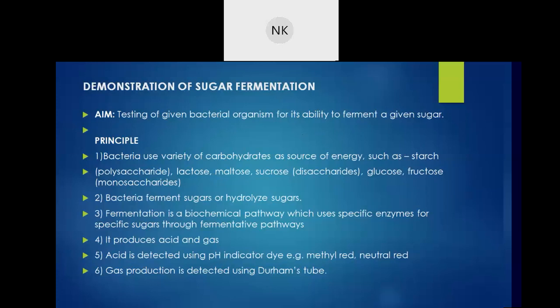So what do you mean by fermentation? It is a biochemical pathway which uses specific enzymes for specific sugars through a fermentative pathway. What do you mean by this? As a result of fermentation, certain end products are formed by the bacteria.